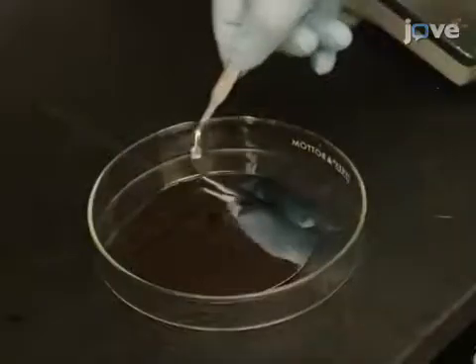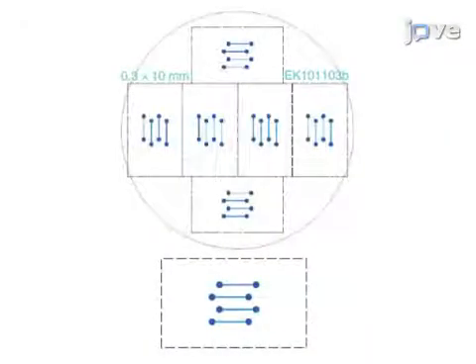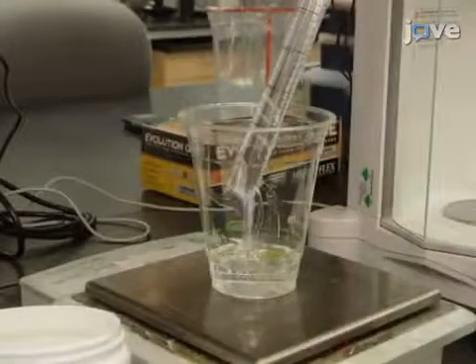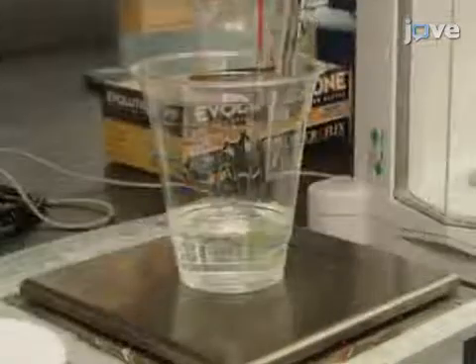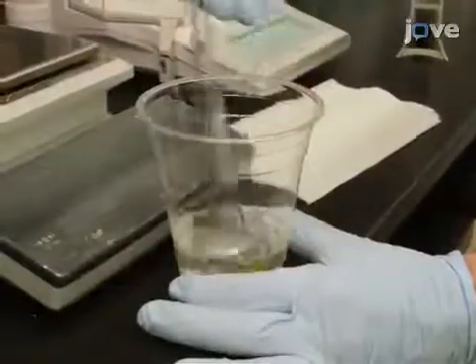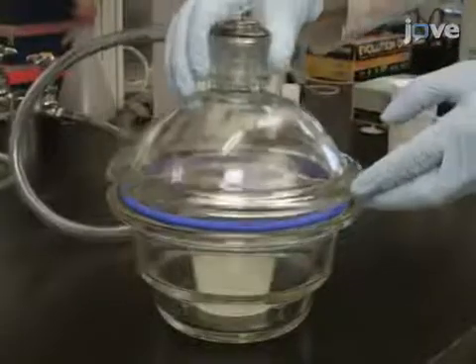To begin, prepare a silicon master mold using standard photolithography techniques and the template shown here. Next, add 100 milliliters of PDMS base and 10 milliliters of the curing agent into a disposable plastic cup and stir the mixture well. Then, place the cup into a vacuum desiccator.